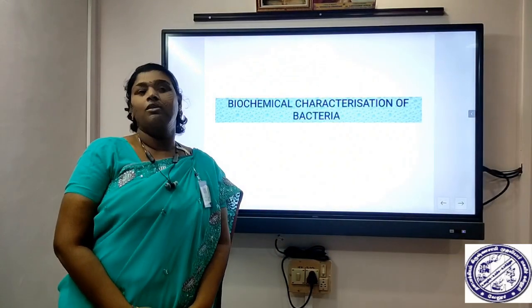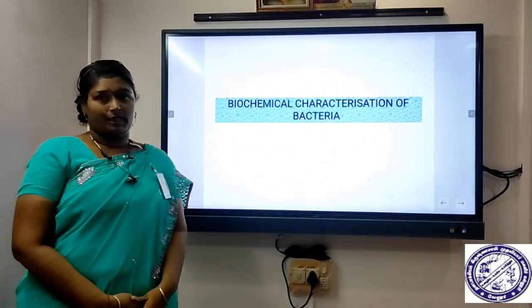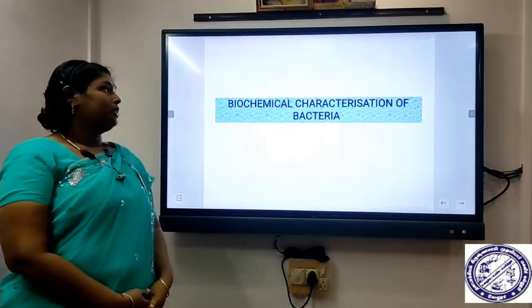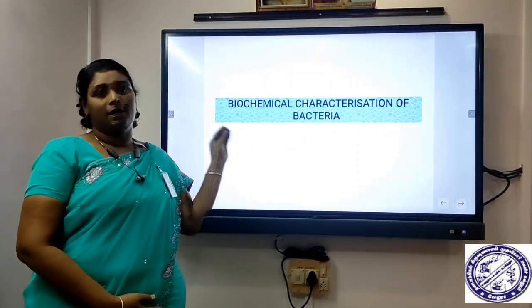Good afternoon everyone. So today we are going to see about biochemical characterization of bacteria. I am Arunadevi from microbiology department, and today we are going to see about the bacterial characterization using biochemical.